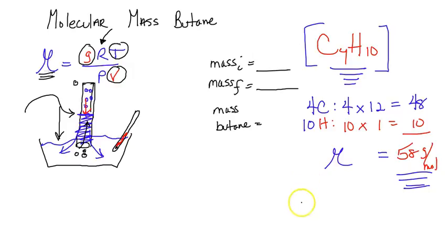Now, the butane that we're using, of course, is all butane, because it's a hydrocarbon that I just drew, and it is a nonpolar molecule. It has an equal distribution of electrons because the carbon bond has the same electronegativity, and the carbon to H bond is very similar. We can almost consider that to be a nonpolar bond. So the butane doesn't dissolve, it doesn't react in water, so it's a good fit to use for water displacement.